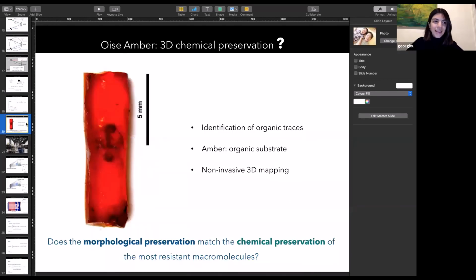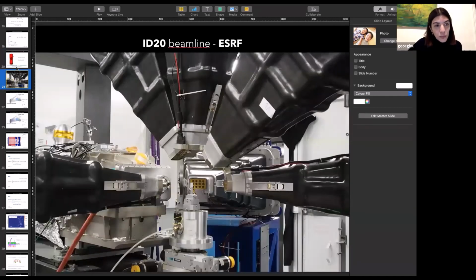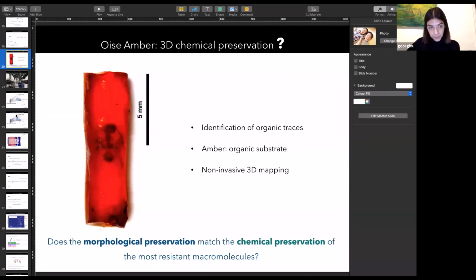Well, for sure I cannot prove there is no effects. What I can say is that also my reference materials were collected in the same conditions, so the radiation-induced effects were the same. If I was repeating this experiment today, what I would do differently is to first collect the data at high energy resolution.